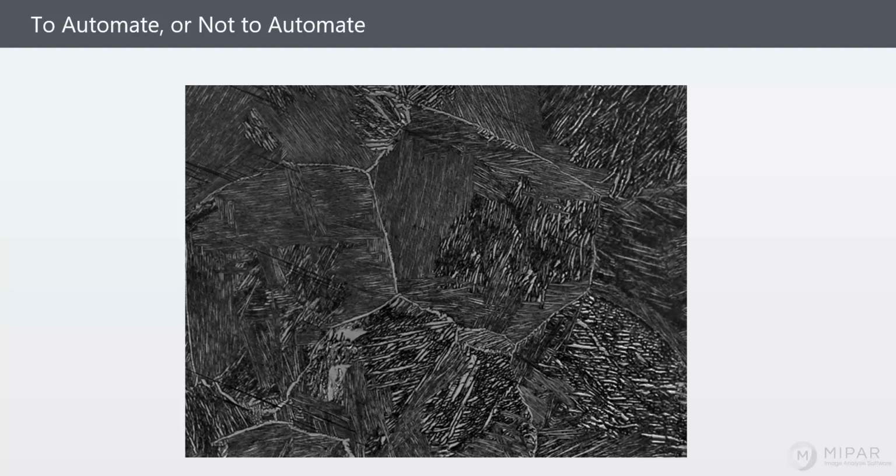Now, this could be any challenging problem in materials, any problem where historic image processing approaches have failed to work. And in these cases, it is absolutely appropriate to ask whether at the end of the day, automation or the attempt to achieve automation really returns significant value versus just spending the time doing it by hand. I mean, I think we all recognize the immense potential of automation, the orders of magnitude time reduction, the reduction in user variability, the ability to obtain more complex measurements than are possible by hand.